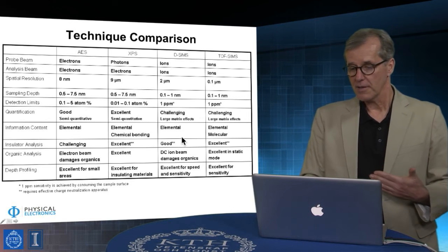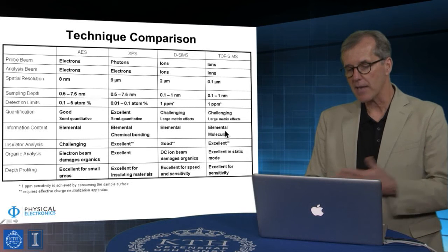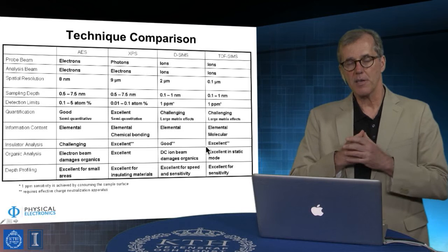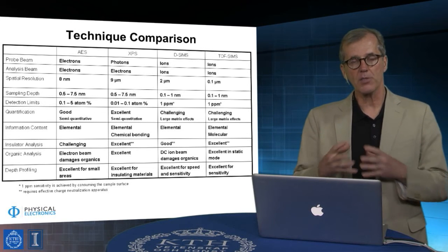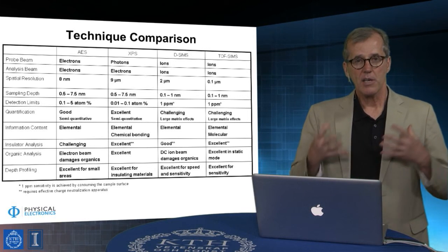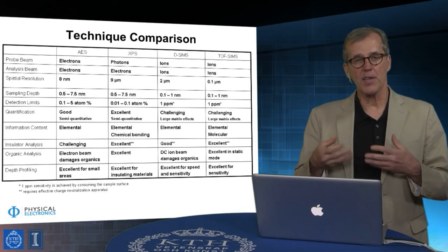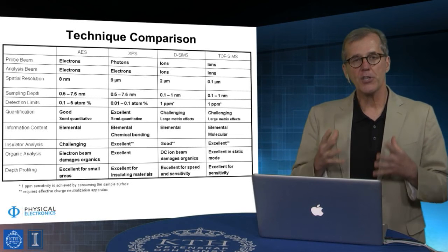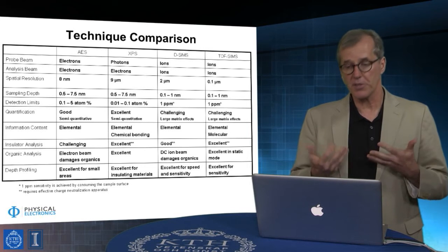What do you detect in dynamic and in static SIMS measurements? Well, in dynamic SIMS, because we're basically just removing gross quantities of matter, it's very much a damaging technique. So it really changes information from its compositionally dependent form into things that are more at the limit of the energetic and dissipative processes that are being used to mill the sample.